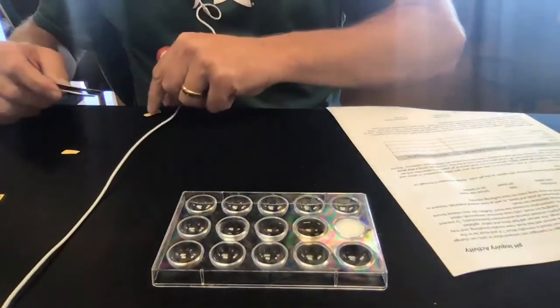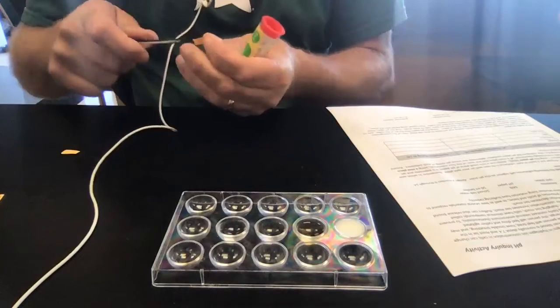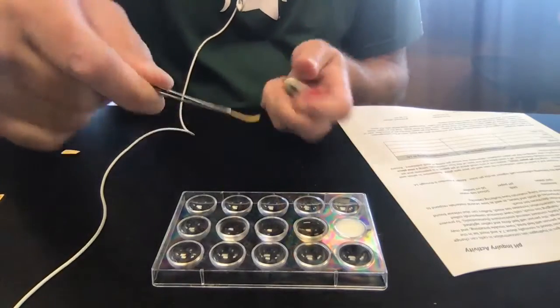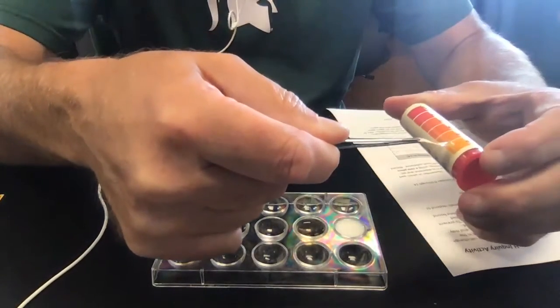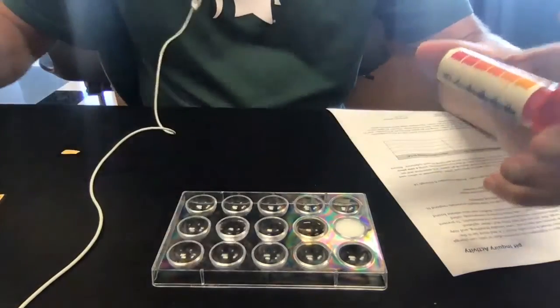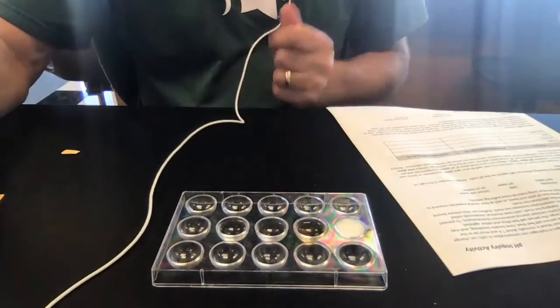And then finally, we just have good old plain tap water. And I'll stick this into the tap water. Bring it out, let it set for a second. I'm going to find that matches up pretty well with pH 6. Okay, so that's just the pH of some common materials.